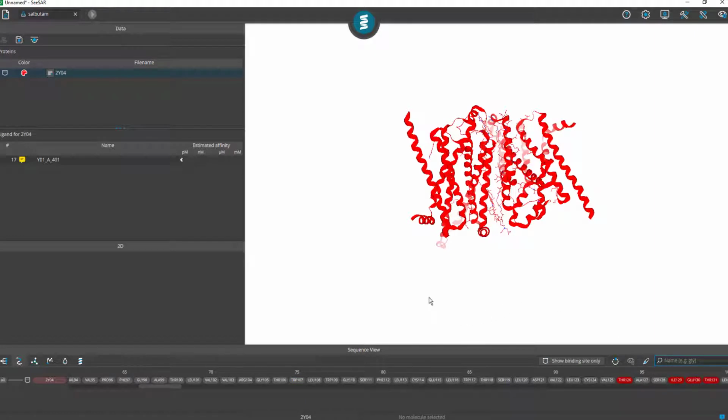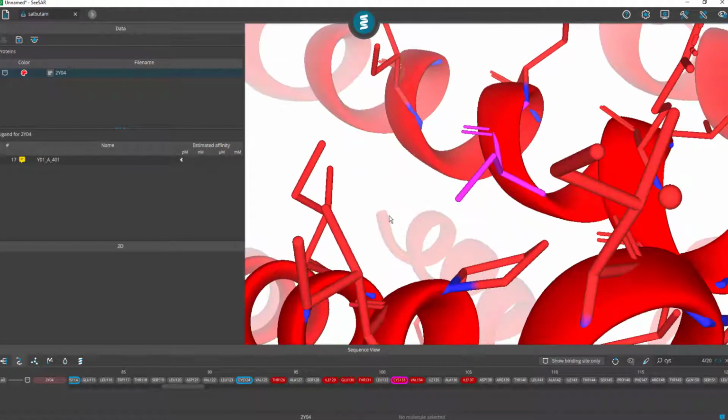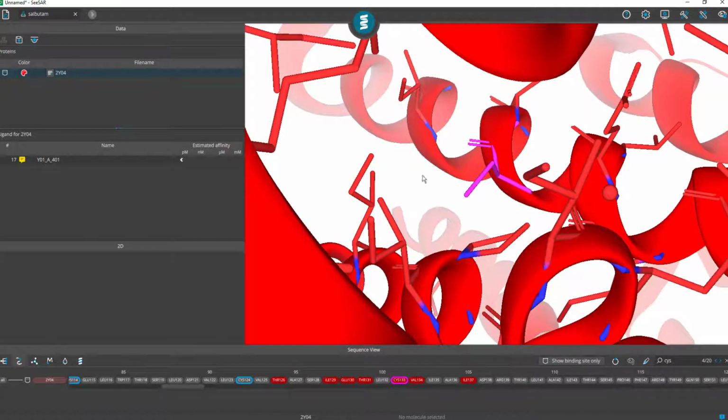So let's now type cysteine, CYS, and then we immediately notice that there are 20 occurrences of cysteines, and one could simply click on the arrow to jump to the next occurrence of the cysteine. And we also see that each of these occurrences are highlighted by this pink circle around. We could right click on this and either choose to hide this component in 3D or call the same focus view action that we saw and click on that, and there we get a zoomed in close-up look of this particular cysteine that we've chosen.